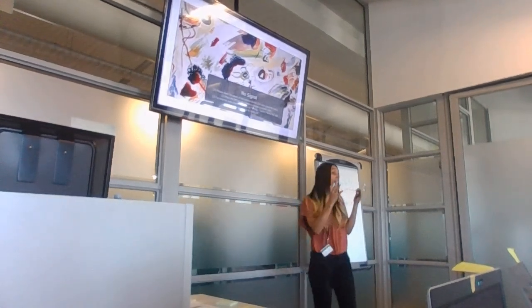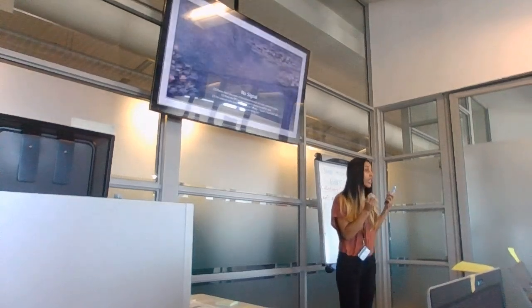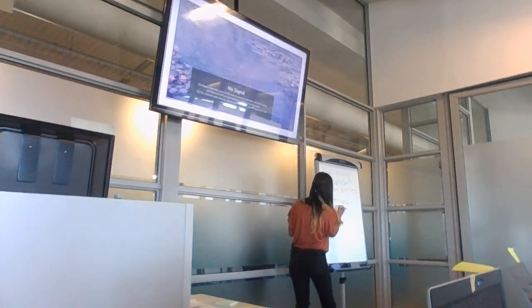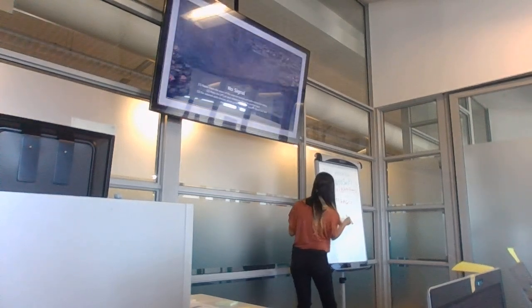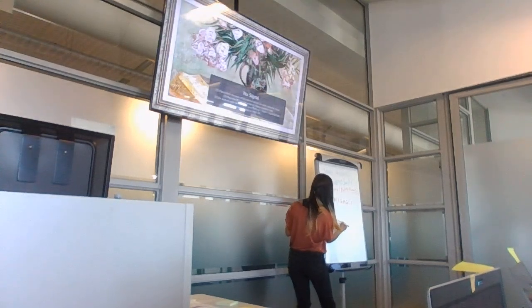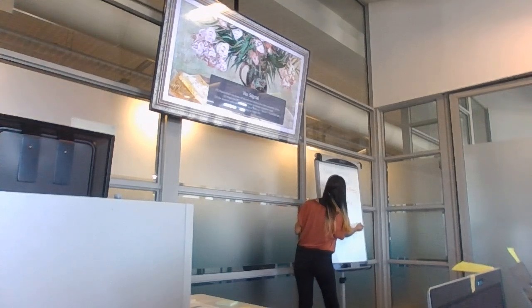It's bigger in size because it has more reads. It can't go longer than the reference genome. So maybe this one has a read here that's a bit longer, and this one has a read here that's a bit shorter, but they both cover the same reference genome, the same position.